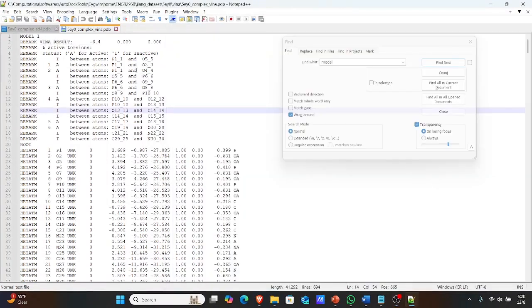Now I'm looking at the Vina file, so a similar concept to the previous file, but it's a little bit different. So again, there are these different docked models, from 1 until 9 in this case, because that's the default number in that software. Here for the Vina result, what these values represent is, the first one is your binding affinity, which in this case would be minus 6.4 kilocalories per mole. And these two are the RMSD values, or the root mean square deviations.